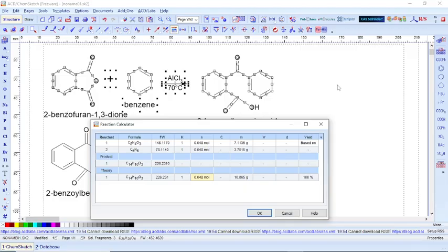You have to convert your mass, because benzene is liquid, but phthalate anhydride is solid, a crystal. So for the phthalate anhydride, we can go straight, get the powder, get a weighing balance, weigh out 7.1135 gram and keep it. Then for our benzene is liquid. We cannot start pouring benzene in a beaker until our weighing balance gives us 3.7515 gram.